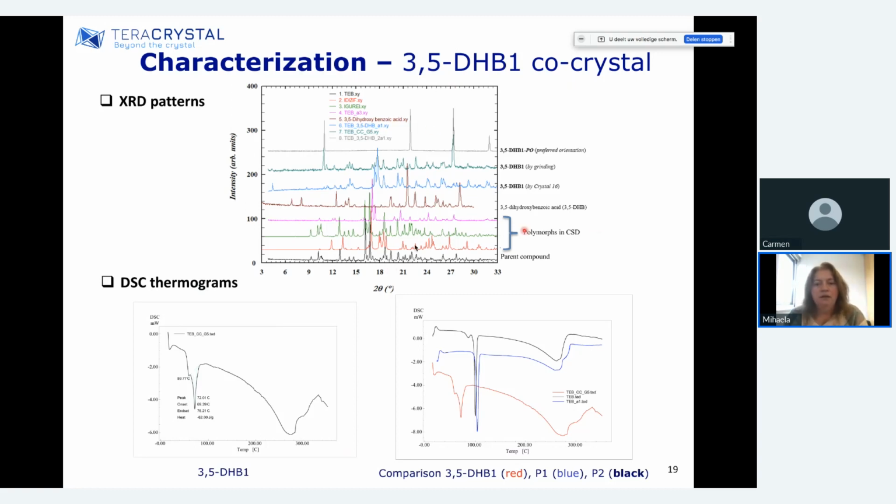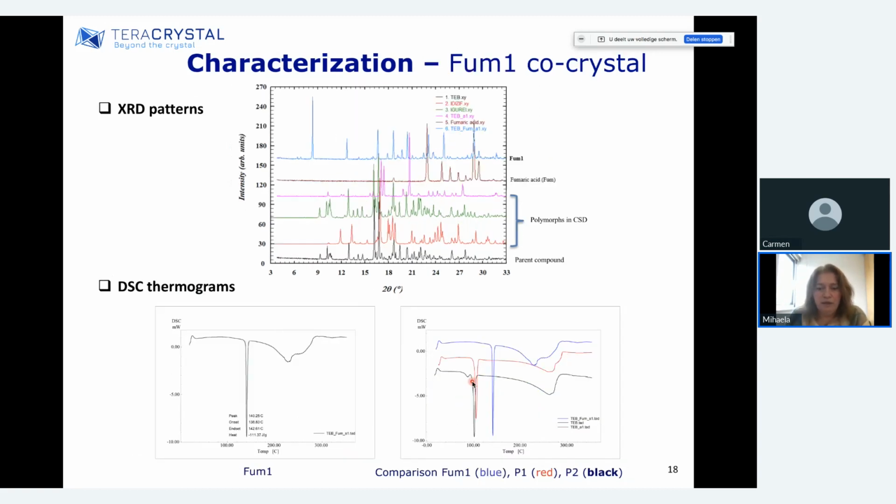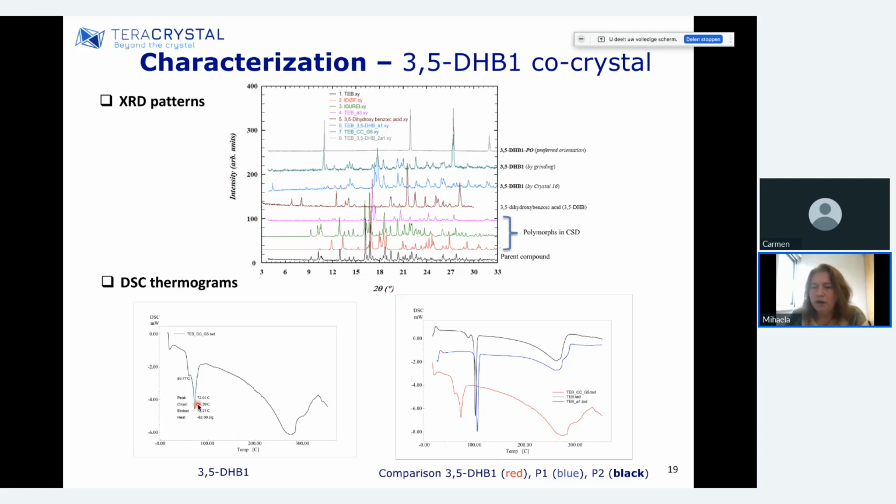Again, comparison. Here you see preferred orientation, we also did crystal growth afterwards by identifying the congruent system and solvent in which this is formed. Then we did also extra cycles in the metastable zone, and then we got preferred orientation of really big crystals. So in this case, you see that the DSC shows a lower melting. If you compare with the previous slide, you see that from 140 more or less, to 70. So you can really modulate your properties a lot by co-crystallization, which makes it so interesting in different applications.